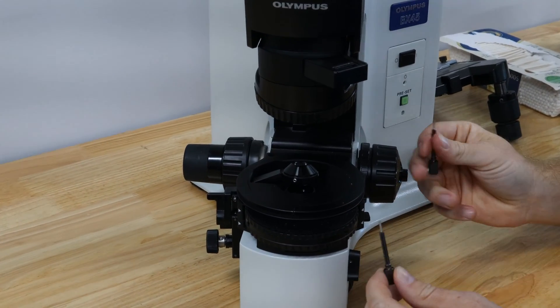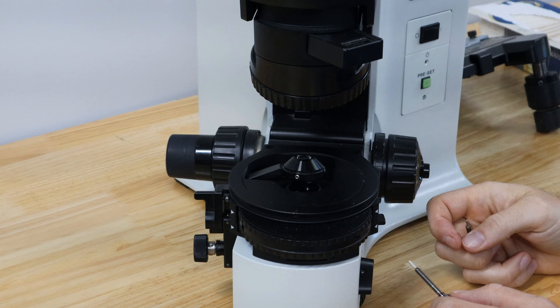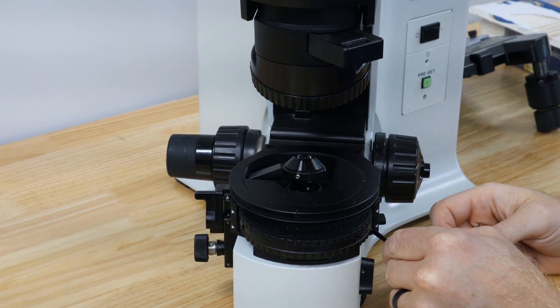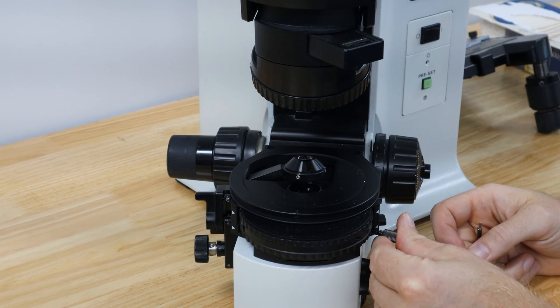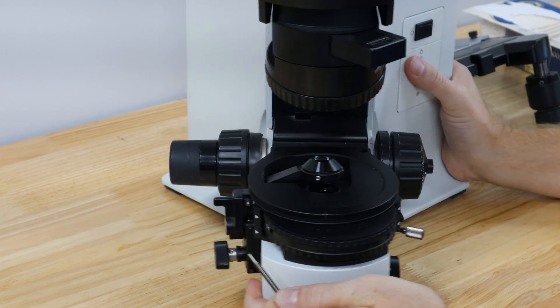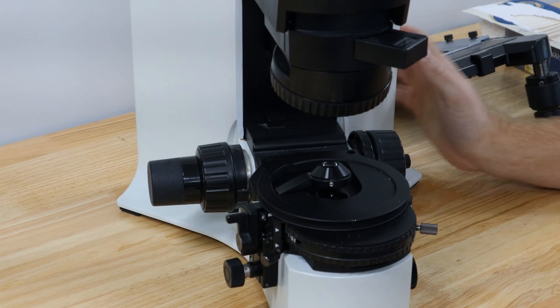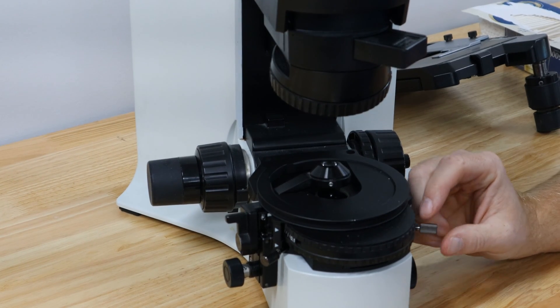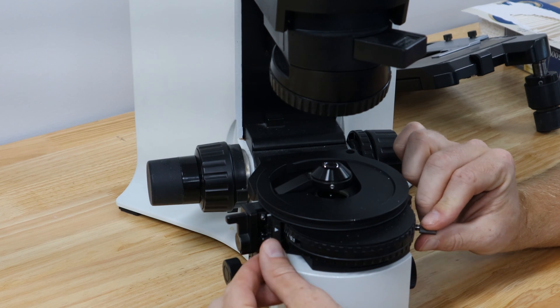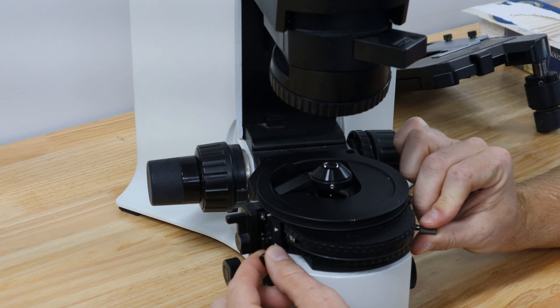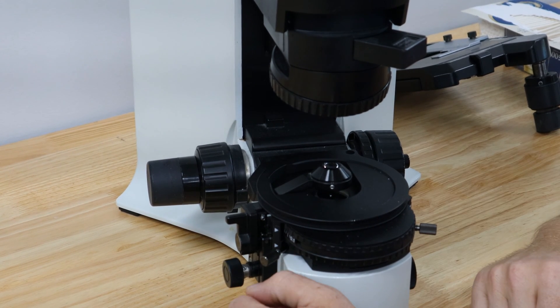Alright so these centering pins that you just took out of the scope are going to go in each one of each side of the microscope. They're going to go on the right one in the left and then you're going to be able to adjust the condenser with these two knobs just like you would on any other microscope to set Kohler illumination.